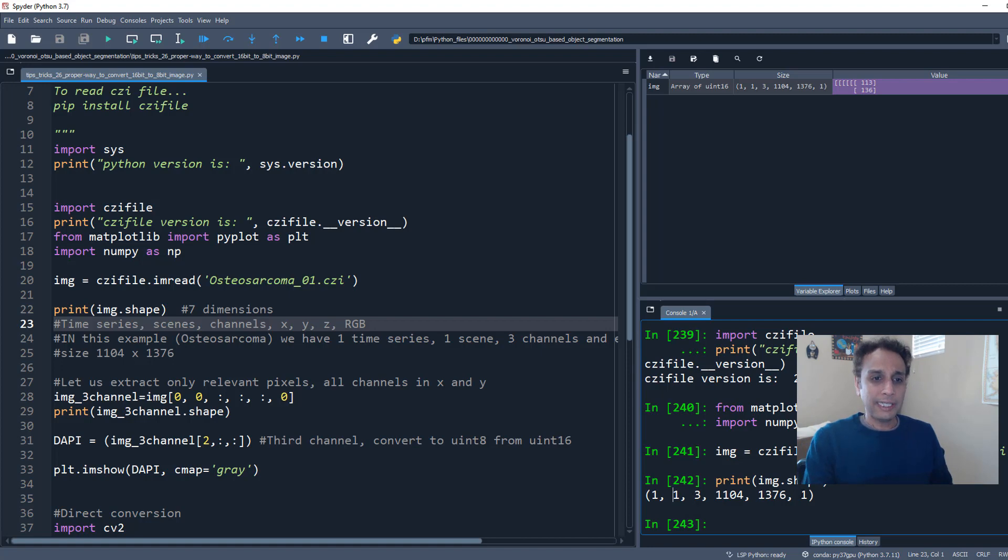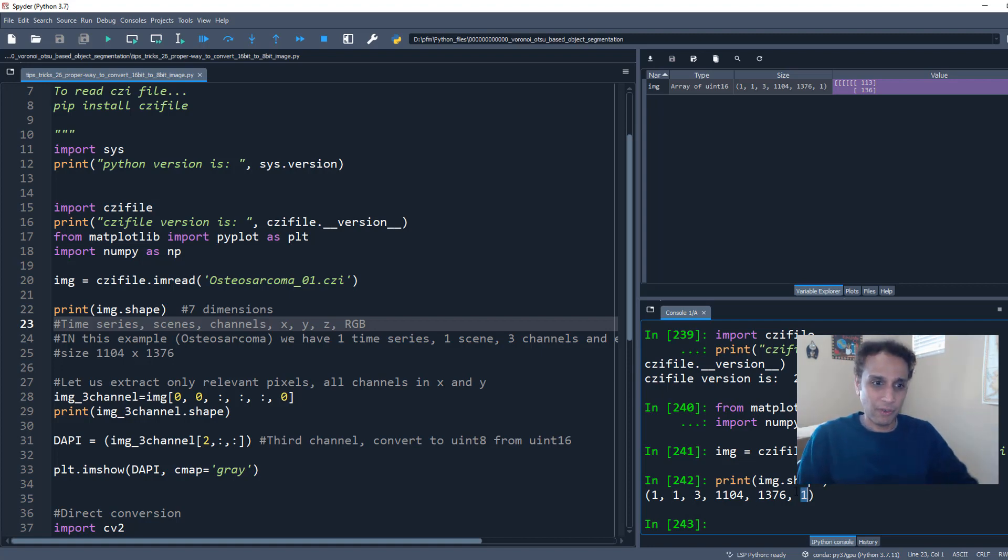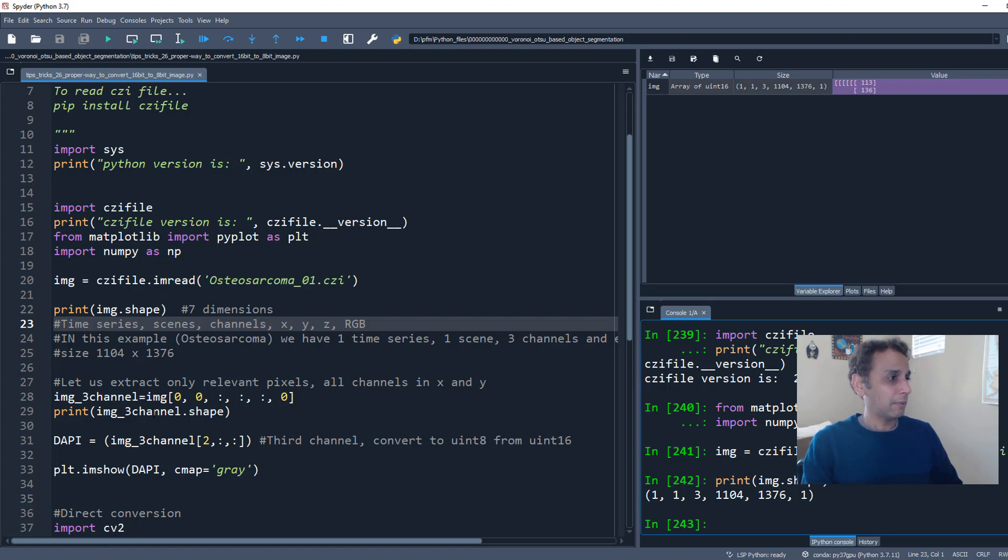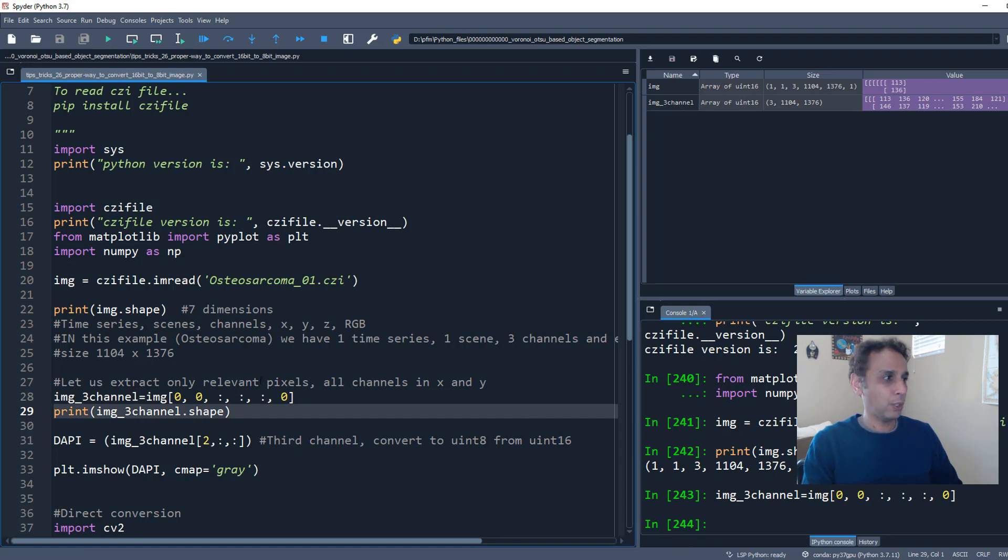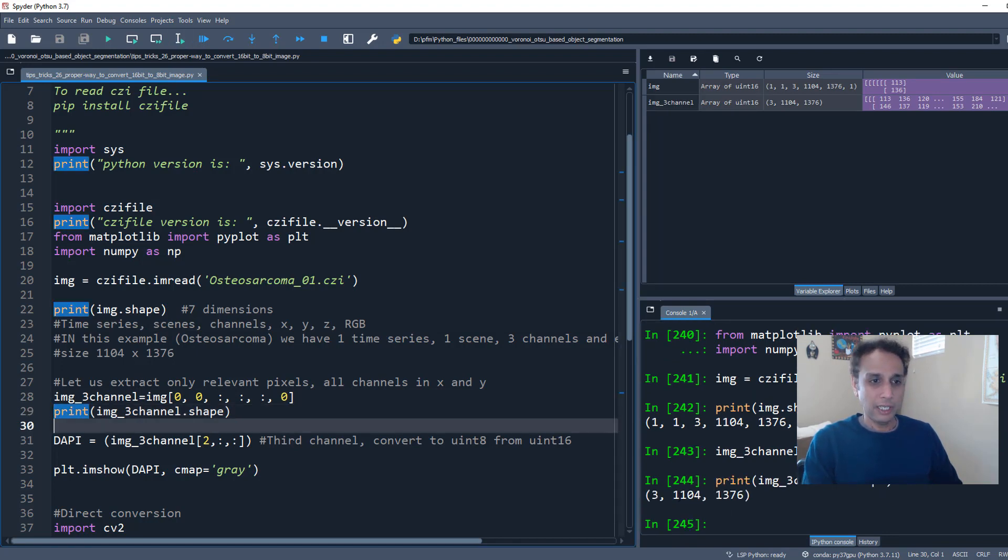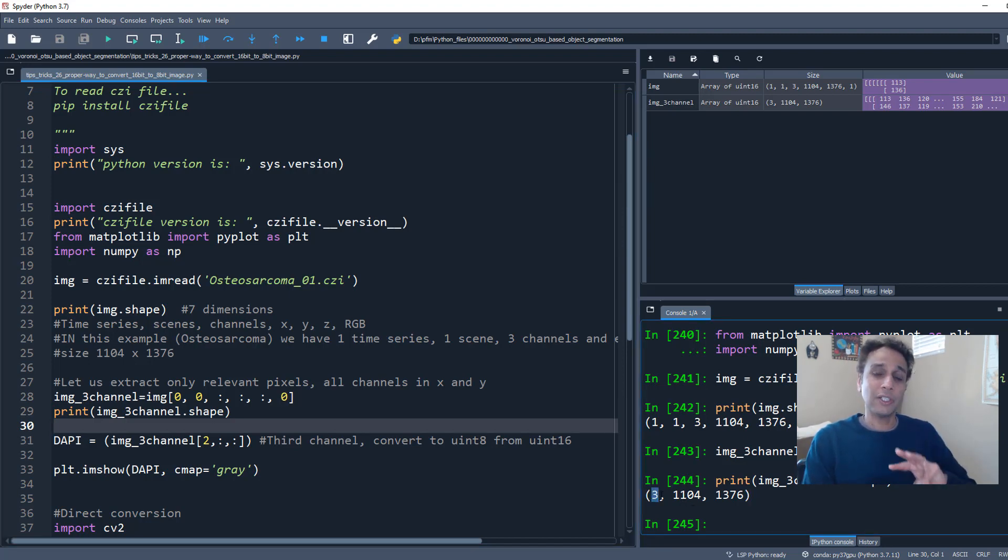Or it can be Z stack. It can be images at different layers, right? And it is multi-channel, like different channels. And these are just width and height dimensions. Okay, enough about images. Let me go ahead and extract the relevant channels, which is going to be my 3 by width and height dimensions.